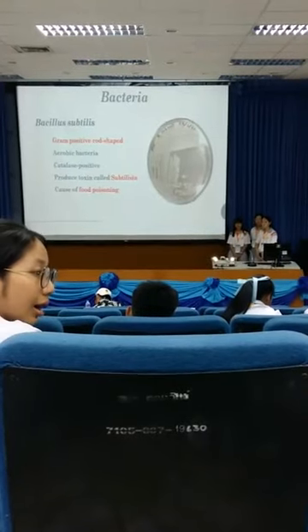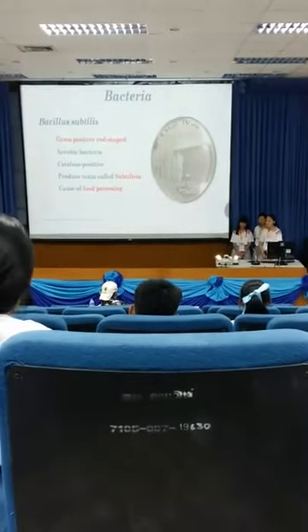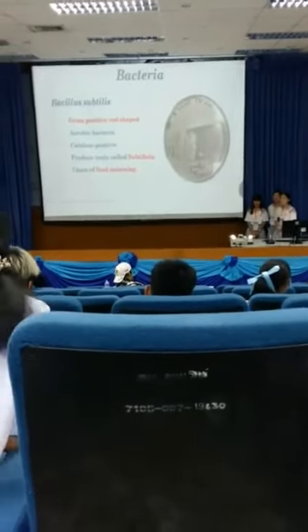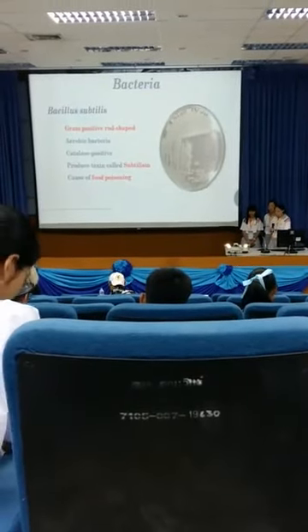There are two methods, DPPH and ABTS. Can you explain to us and your friends a little bit more how to run this process?